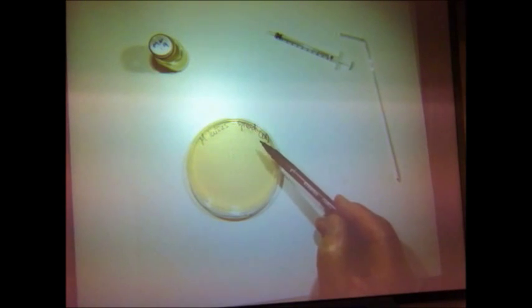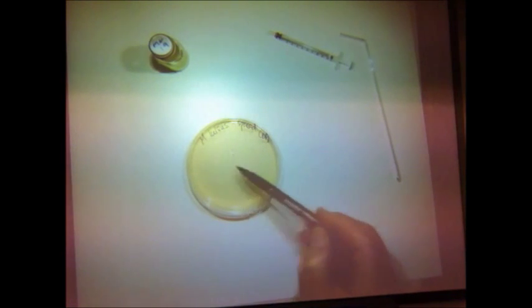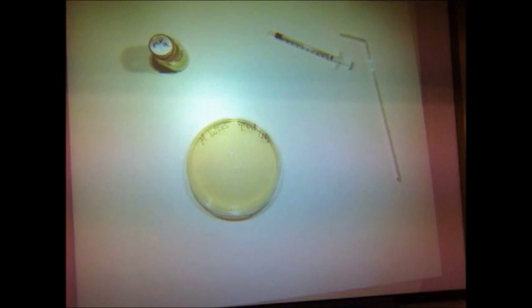It's always best when you're labeling plates to write around the edge. As you'll soon discover, if you write across the middle, it obscures the growth of the culture and you can't actually see the results.